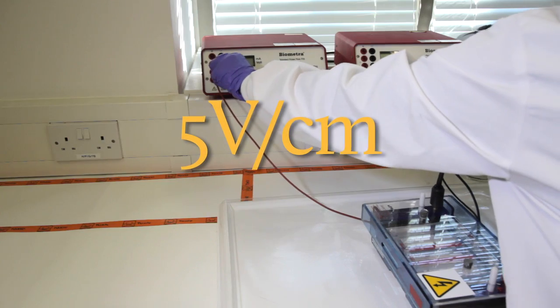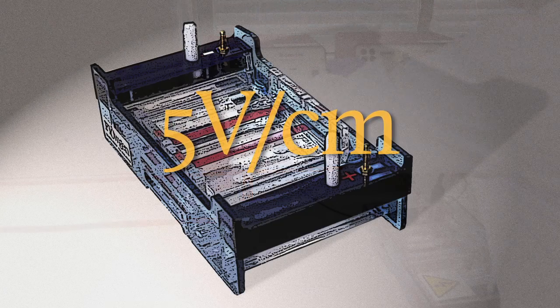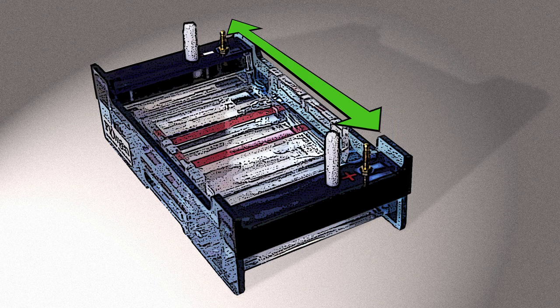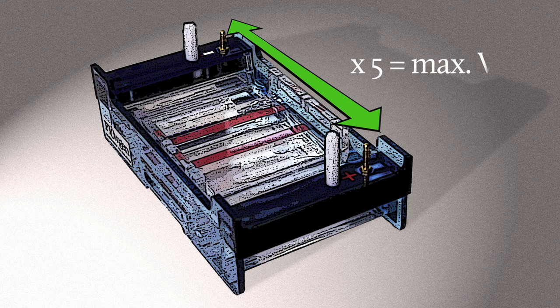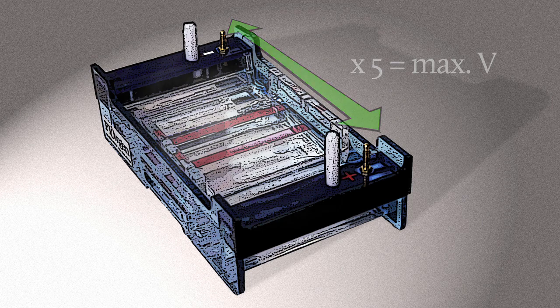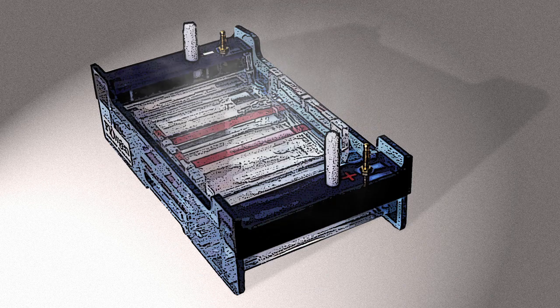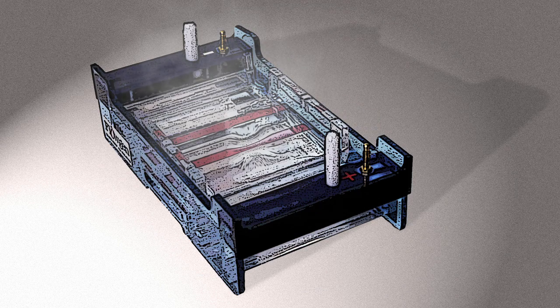Gels should not be run faster than 5 volts per centimeter. If you take the distance between the electrodes in centimeters, and multiply by 5, this is the maximum voltage. If gels run too fast, they will heat up and could melt. Hotter running gels won't resolve as well.